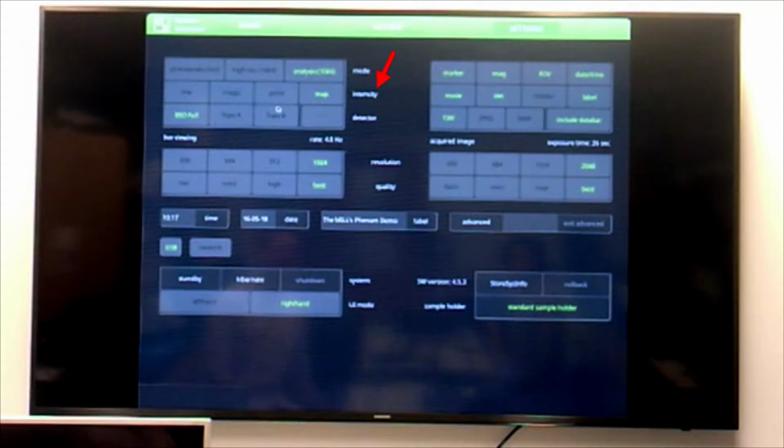In terms of intensity, this is more specifically referring to EDS and some of the various techniques you can do there. First off, there's low intensity. That would be more applicable if you aren't doing any form of EDS and you would rather just take images. Also, the image intensity is usually what I stick with when I do imaging. The low intensity usually doesn't work well for me, so I usually stick with imaging intensity if I'm just doing images. However, if you are planning on doing point maps on your EDS, go ahead and pick the point intensity. That'll improve the resolution that you require. And lastly, if you are planning on doing mapping in your EDS, which we will cover a little bit later, go ahead and select the mapping intensity. That will also work rather well.